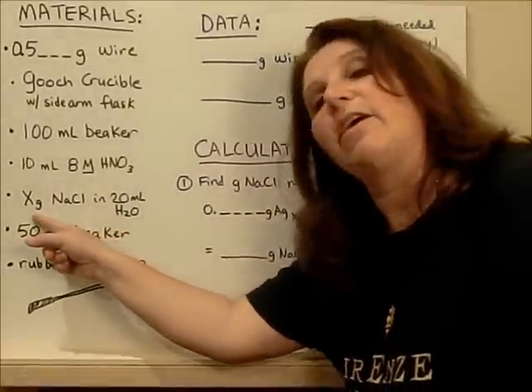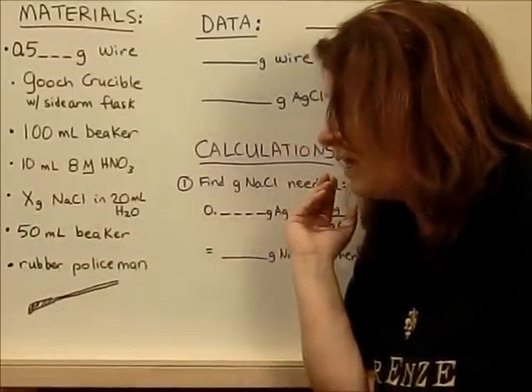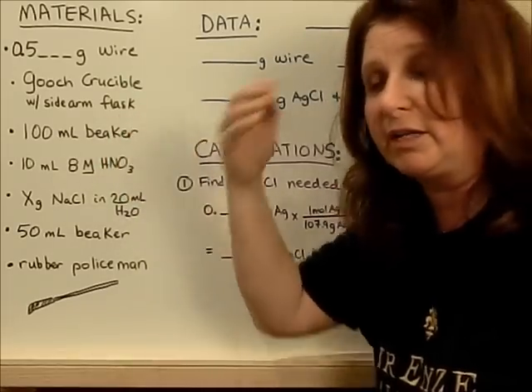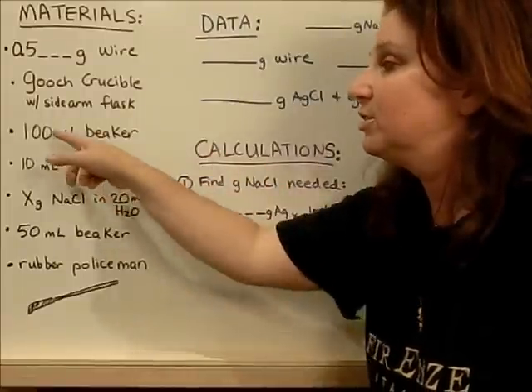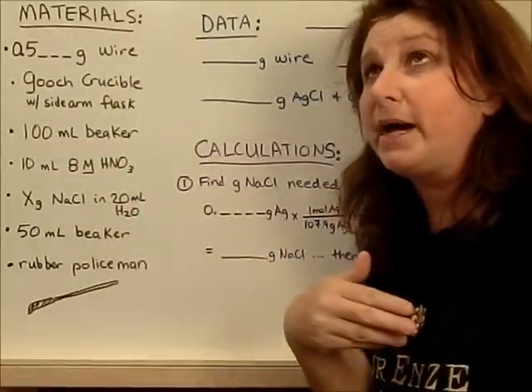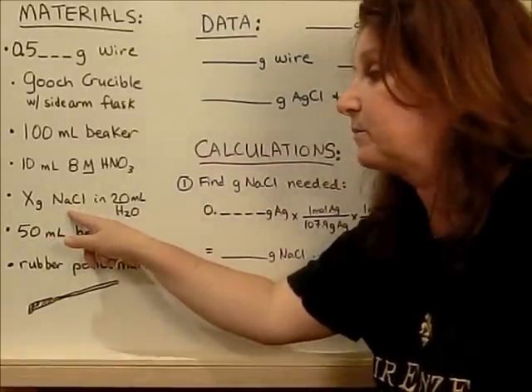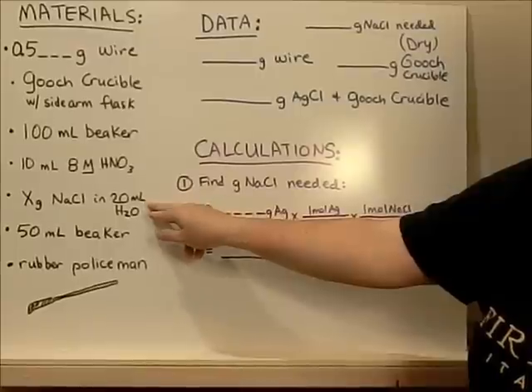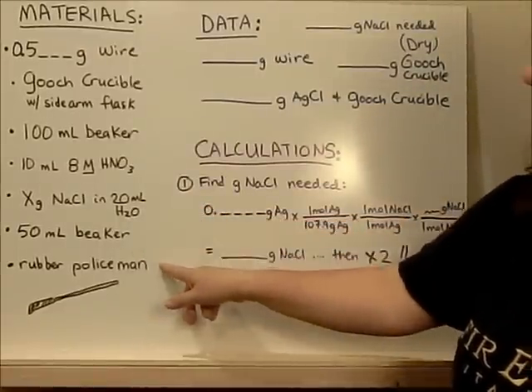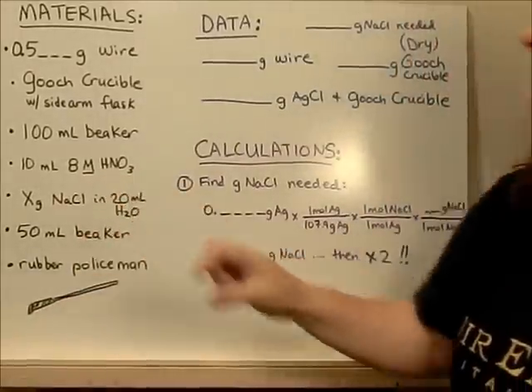You're going to need to figure out how much sodium chloride you're going to dissolve in about 20 mils of water. And this is some math that you're going to have to do while you're cooking your silver, your wire, and it takes about 15 minutes to cook it. So you're going to be cooking your silver in this beaker with the acid, and then you're going to run back to your lab bench with your partners, actually calculate how much salt you're going to need to weigh out next. So you weigh out your salt, throw it into 20 mils of water in a 50 mil beaker, and then you're ready to go. You're also going to need a rubber policeman, which is simply a stirring glass rod with a tip.